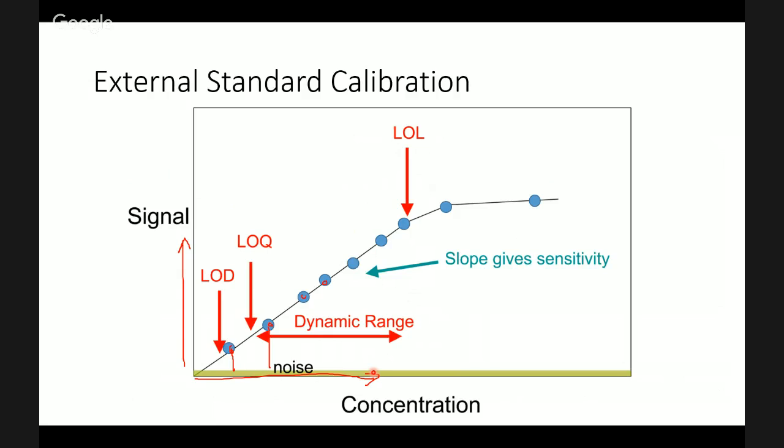Okay, so there are some things that we need to consider when creating a calibration curve such as this. For instance, when we get to very high concentrations, we might not continue to get a proportional response from our detector. It might be that the signal intensity is so high it saturates the detector in the mass spectrometer, or that the concentration is so high that there's so much dissolved salt in our solution that it inhibits the uptake of the sample into the mass spec.